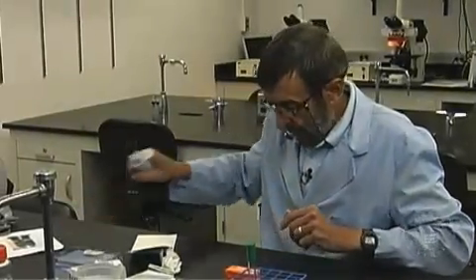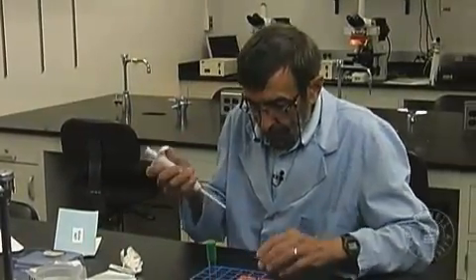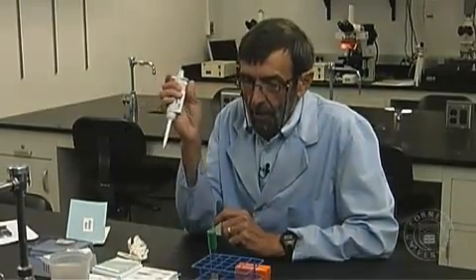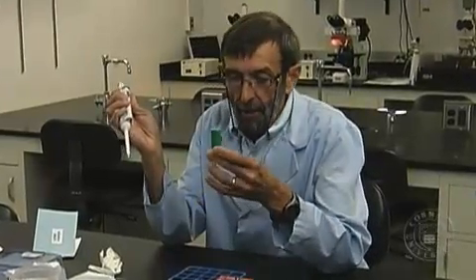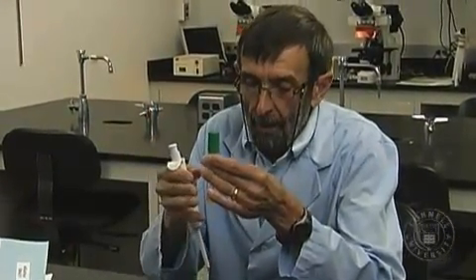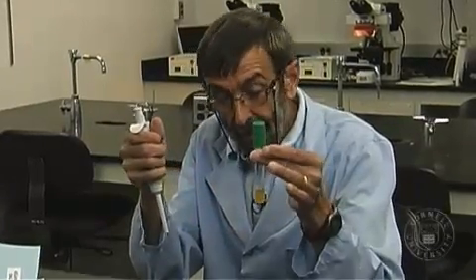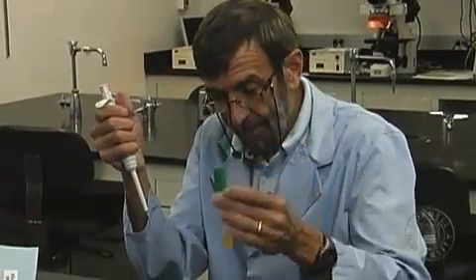I'd like to demonstrate a technique for making a wet mount using a precise amount of fluid. The fluid I'm going to use here is a bacterial culture — it's E. coli — and I can tell by looking at it that there are quite a few bacteria in there because it looks a little bit cloudy.